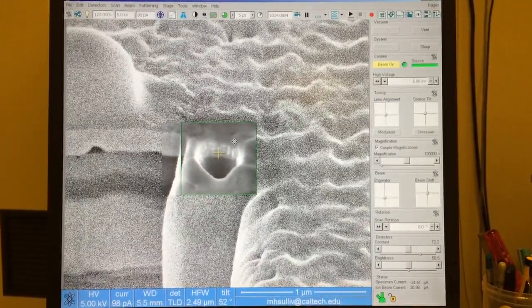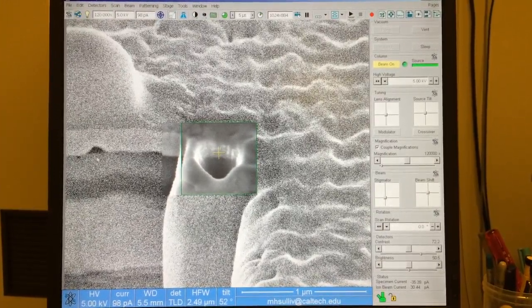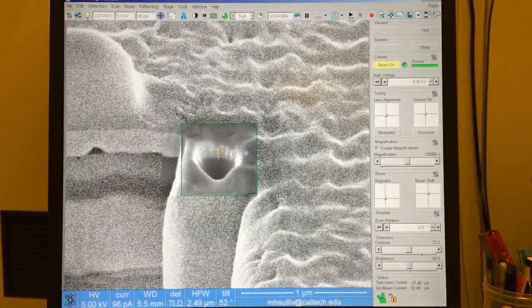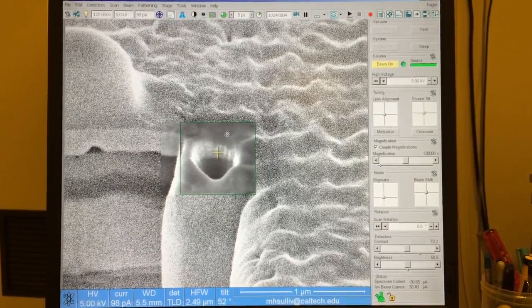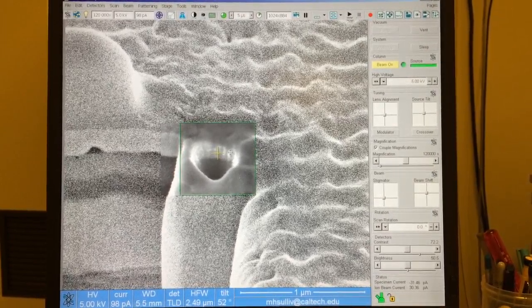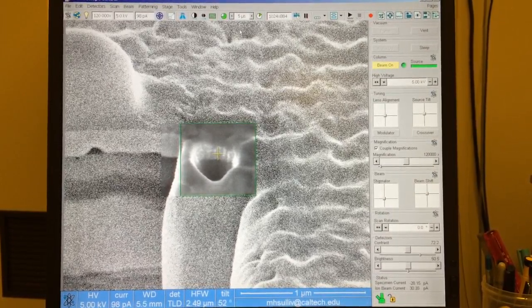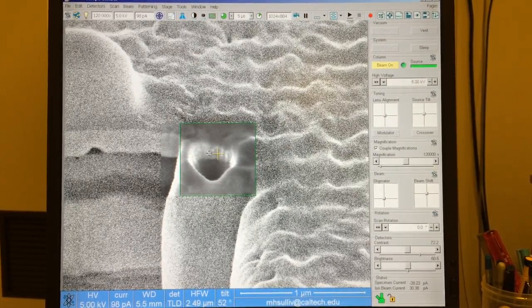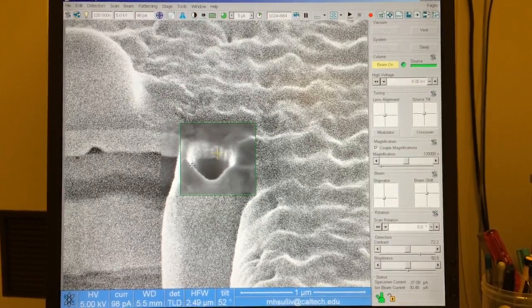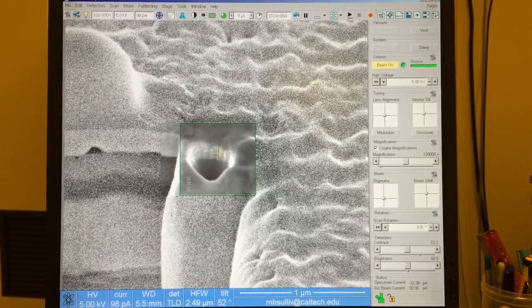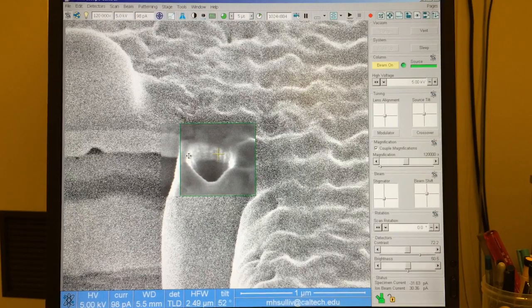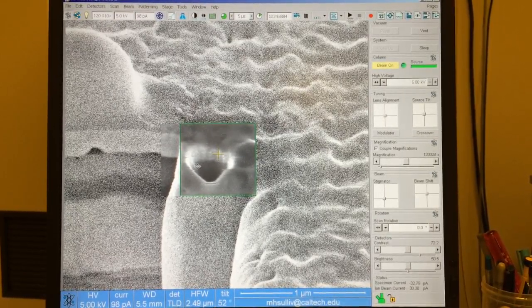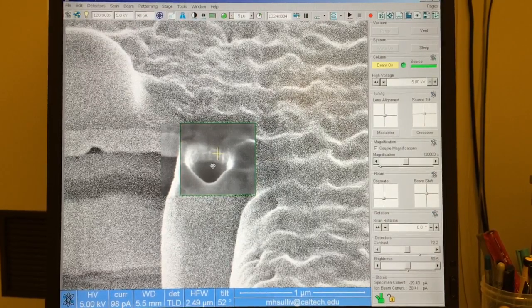Now that I have a first approximation alignment, I'd like to see if I can perfect it on the actual cross-section surface before taking the final image. The principle behind that first approximation alignment is that we're using a reduced window, which allows us to scan at a reasonably long dwell time, something like 3 or in this case 5 microseconds, giving us a pretty clear image where we can see some of that texture, and also a relatively live refresh rate — refreshing maybe twice per second — which allows us, as we're changing the focus or astigmatism, to see those changes in real time.